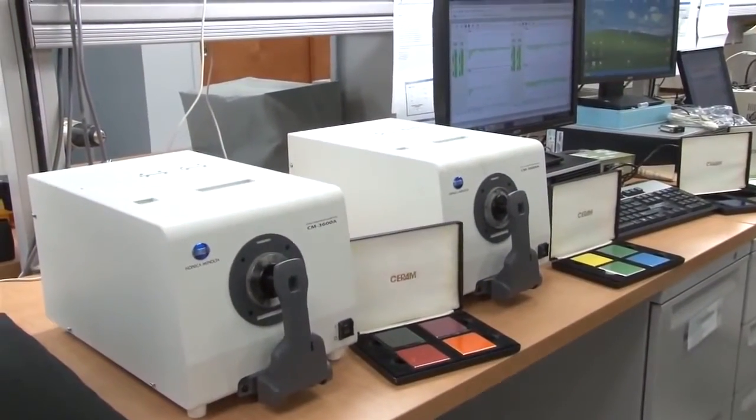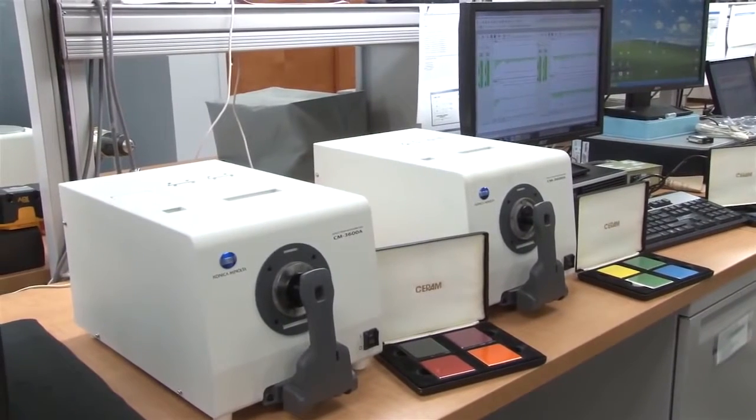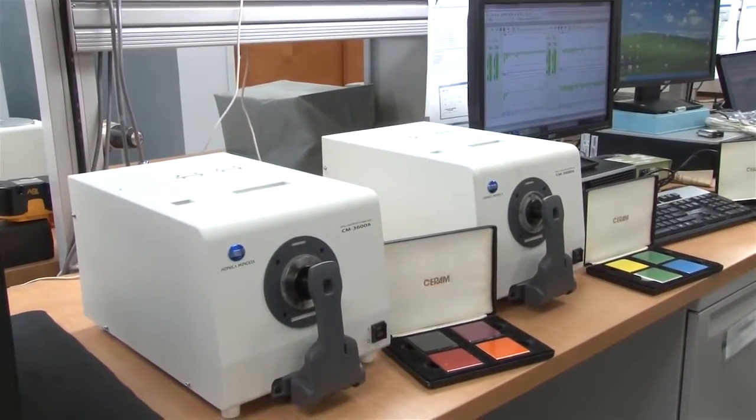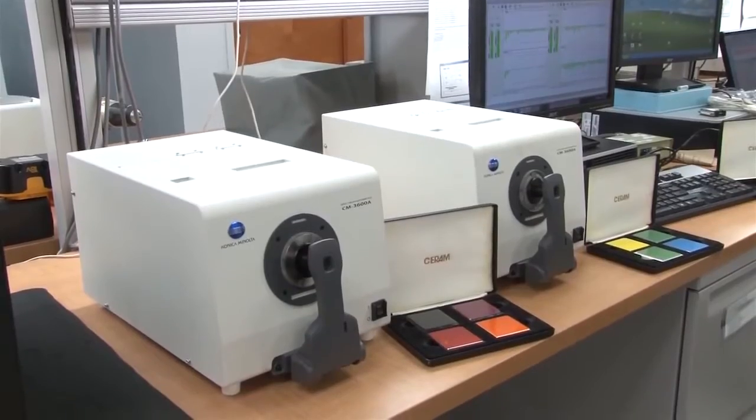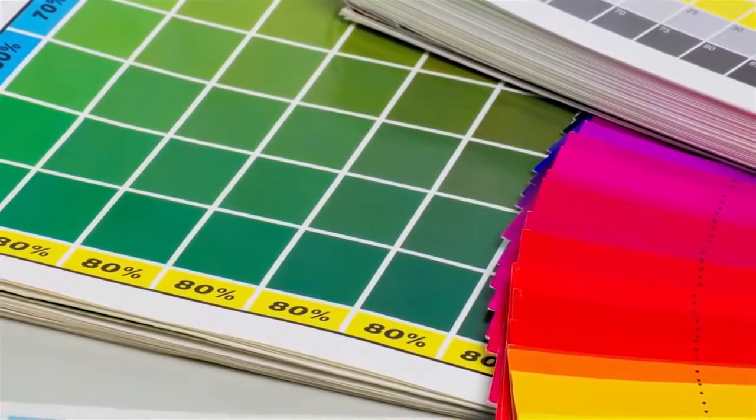Built for precision, the CM3600A's tight inter-instrument agreement allows users to communicate, share, and coordinate color seamlessly throughout the supply chain.